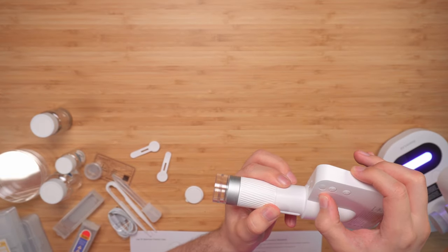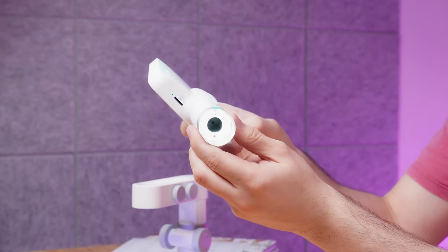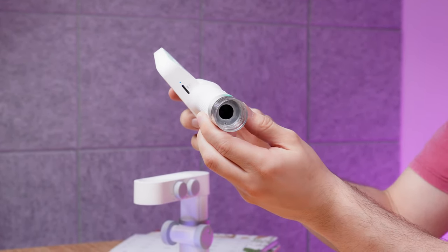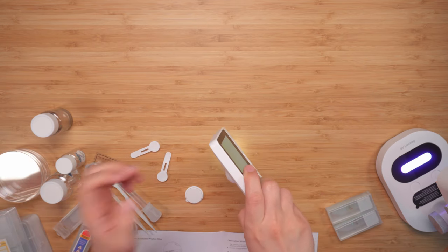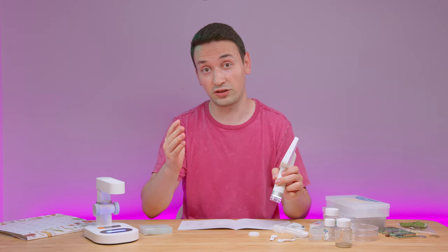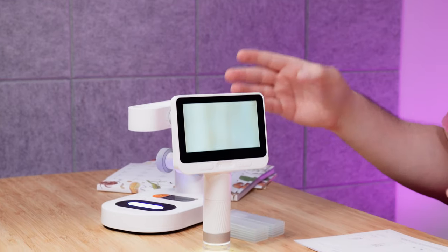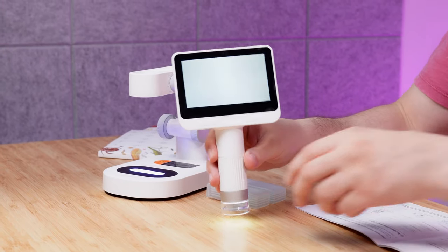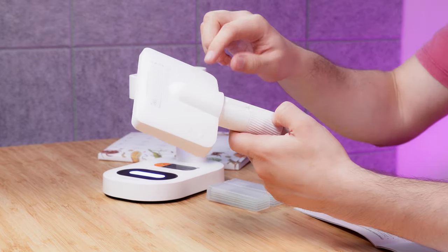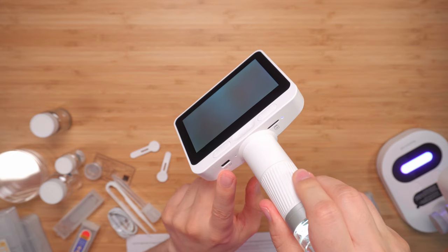The unit is on now so you can see the lights. The good thing about the light is I actually had to turn it down at most places during testing because it seems too bright — which is a good problem to have. You can use this in any environment; it doesn't really have to be daytime.